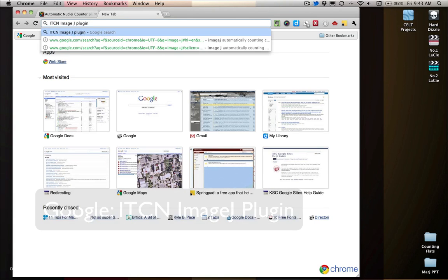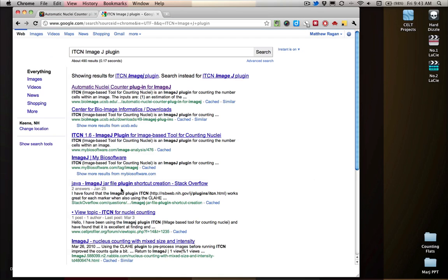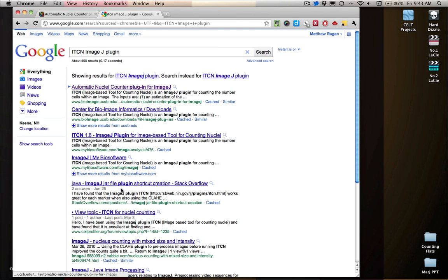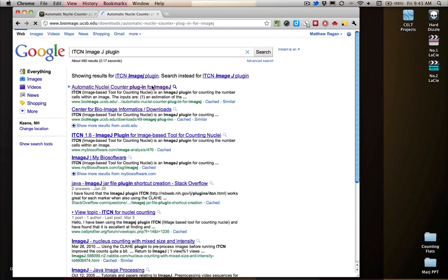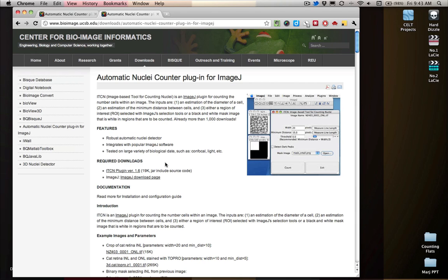Here's my little Google search, and what I'll get is I'll get this wonderful little page and lucky for me, it's this top hit right here. So do a little search for that. You'll find this exciting thing.